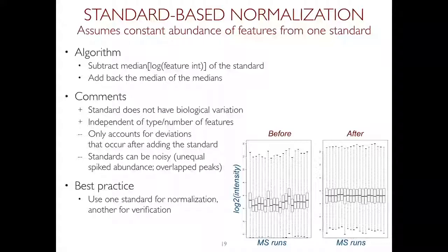Other question, Tina? For this data set from Selevsek, you said that there was a pre-experiment done with 8 samples to find the features that are most varying. But with DIA, couldn't we have done it directly on the data? Why was it necessary to do an additional pre-experiment? Well, I think that was also part of experimenting with the DIA settings and all of that. It was part of setting up the assays, because it was a while ago, right? So there was more work to do.